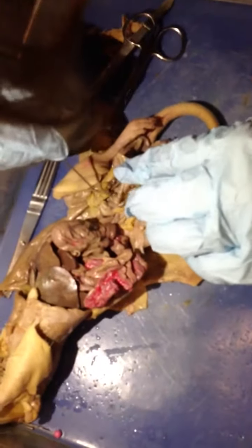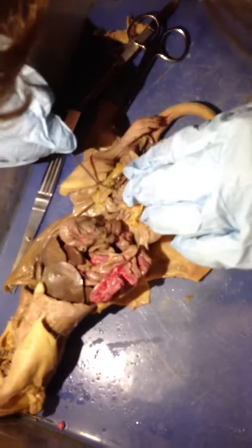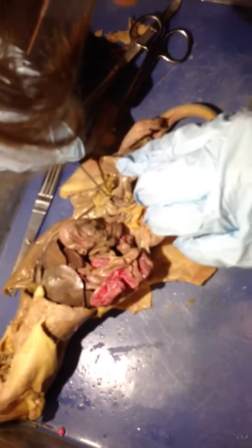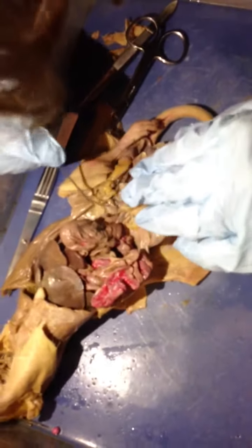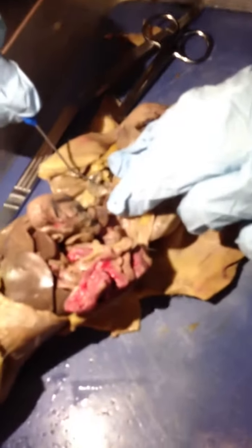Let's do this. So this is your bladder. And then on either side are the prostate glands, right here. This is your vesicular gland. You guys don't have a very big vesicular gland. Oh, this one's better. Alright, vesicular gland is like the rough part, and the coagulating gland is the smoother part on the side.